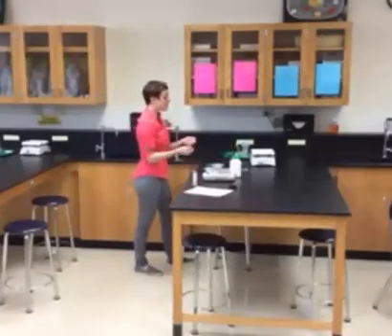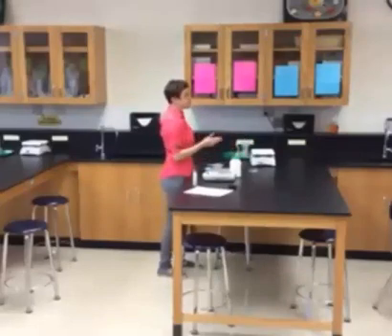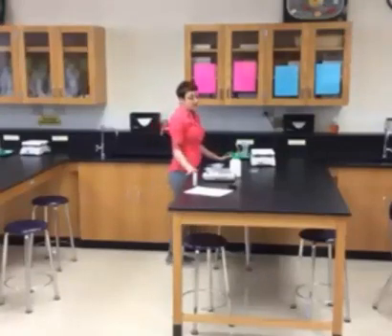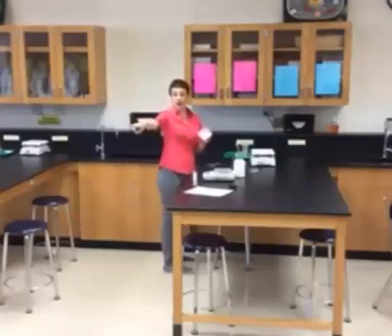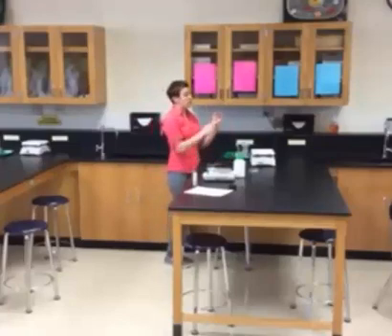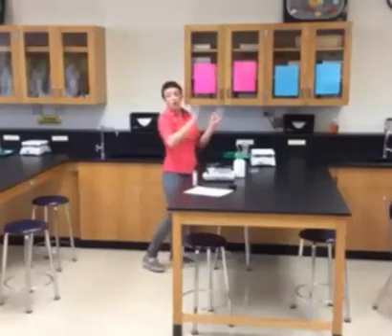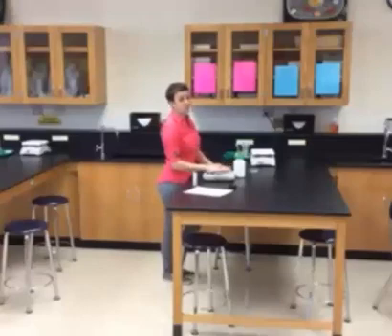When everything is dissolved, raise your hand and I'll come over with a tray that has two petri dishes on it. We are going to pour the Jell-O evenly into the two petri dishes and let it sit overnight until Thursday afternoon. Make sure you wipe your weigh boats off with a dry paper towel so we can reuse them. Clean off your stir rod with water and a paper towel, and make sure you clean all of the Jell-O out that may have started to solidify on the bottom of your beaker. Put everything on the carts in the specific spot.